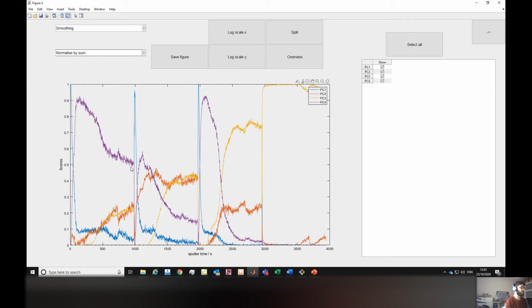So it gives you some information on the layer thickness of what you're looking at, only by looking at the yellow signal that's not taking over. So you still have some dominance of the purple, which we know is related to the insides of the organism, and so on. It is a very complex data set.